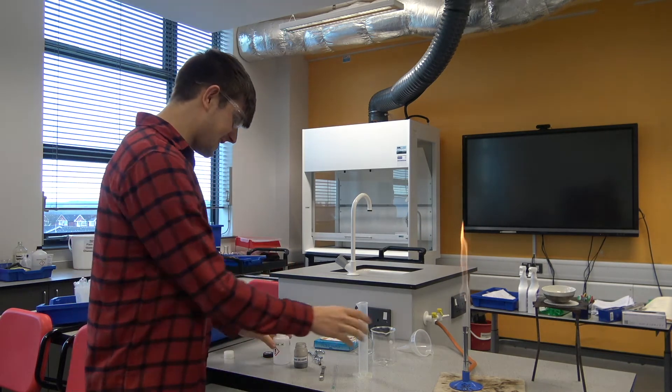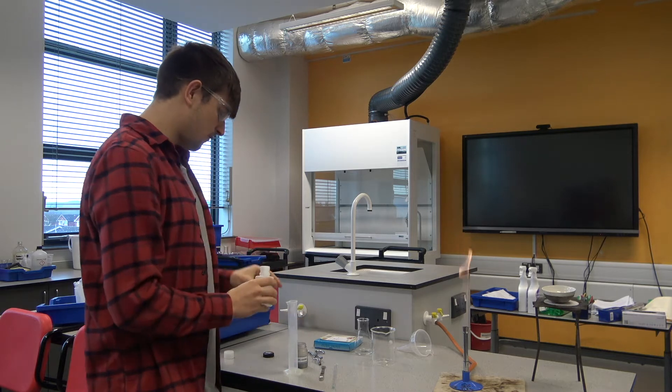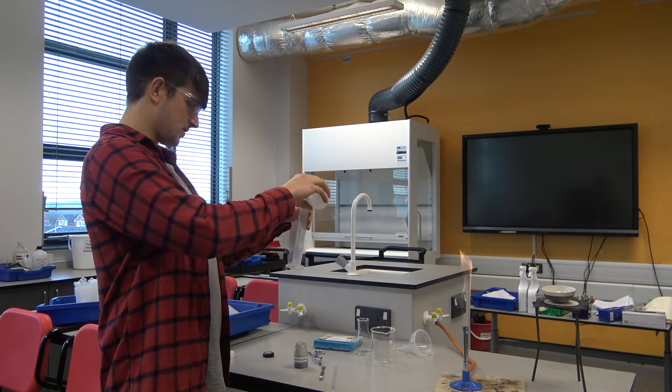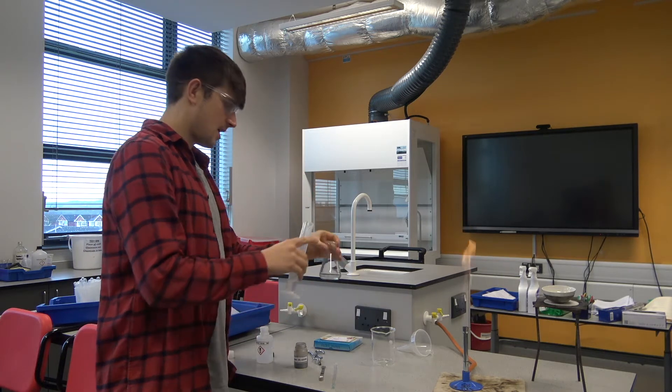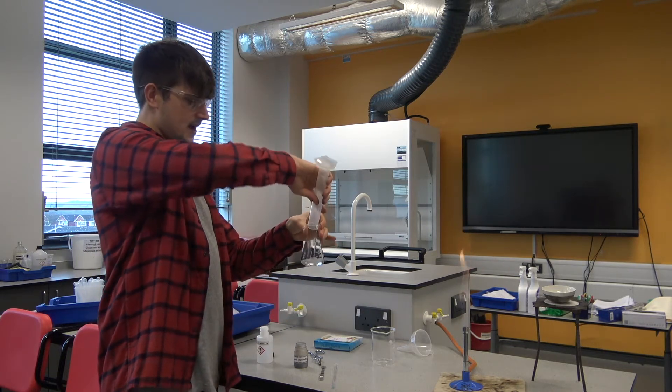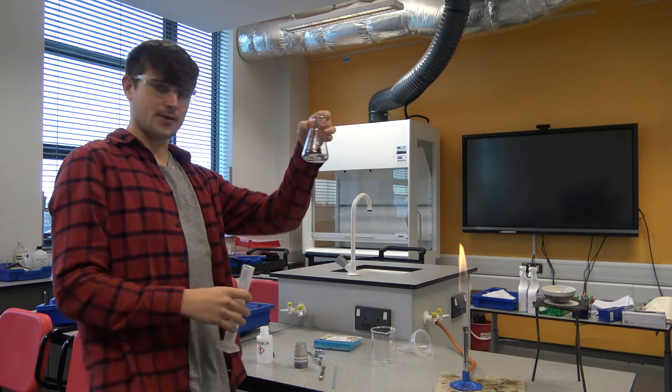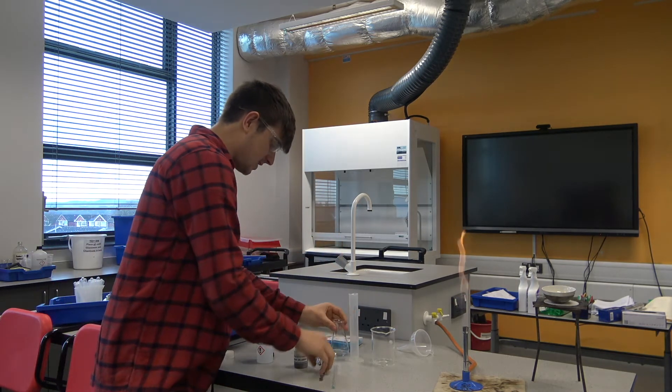The way this practical works is by reacting sulfuric acid, and usually it's a known amount. So we're going to measure out 10 milliliters of sulfuric acid and add it into our conical flask.